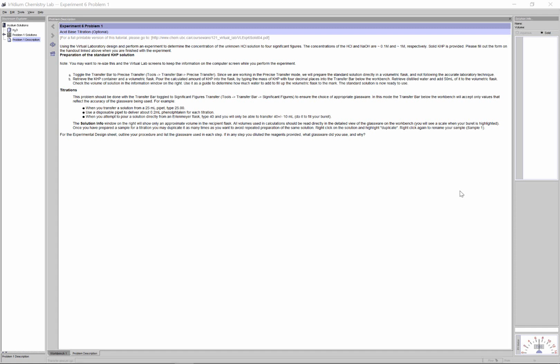Basically, I drop in the NaOH slowly enough that I make sure I hit the equivalence point, where I just added the last drop of hydroxide to exactly match up with how much acid there was, making sure that you don't have any limiting or excess issues. That way, we've counted the HCl. I knew the initial volume the HCl was in, and I simply do moles divided by liter, and that gives you your unknown concentration.